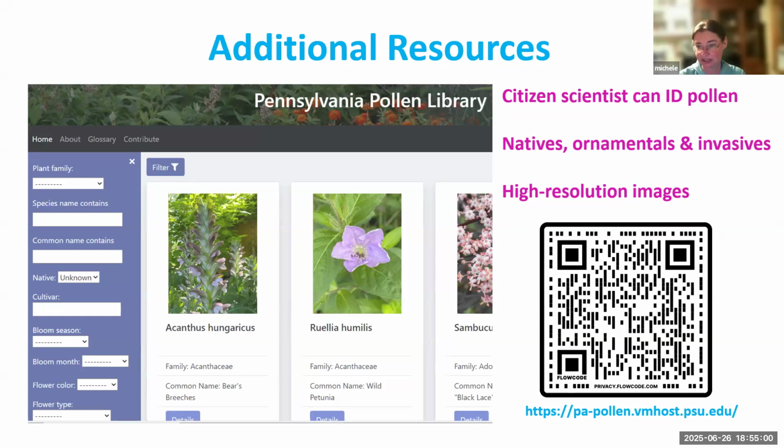Another resource. I fully appreciate that the pollen identification is really expensive. Obviously some of this is because it's a six to eight week process, and a lot of that is labor. But I also appreciate that a lot of people don't have the time or the resources to devote to submitting a gazillion samples to me, or even one. I try to make it as friendly as possible, but another resource is available for people who do want to try to look at their own honey or pollen samples and identify what they've got.